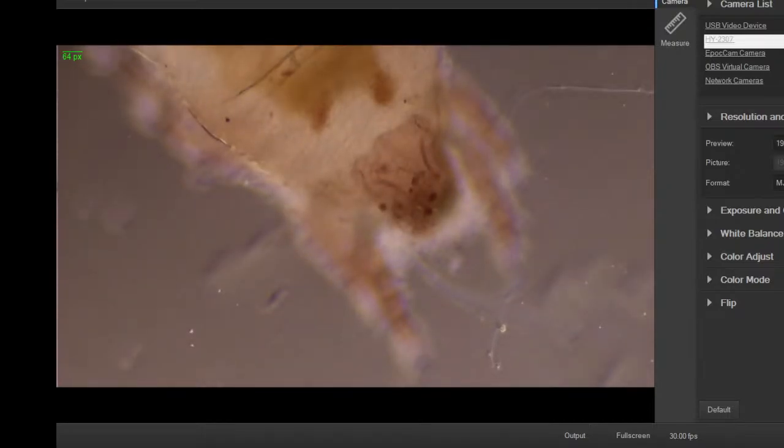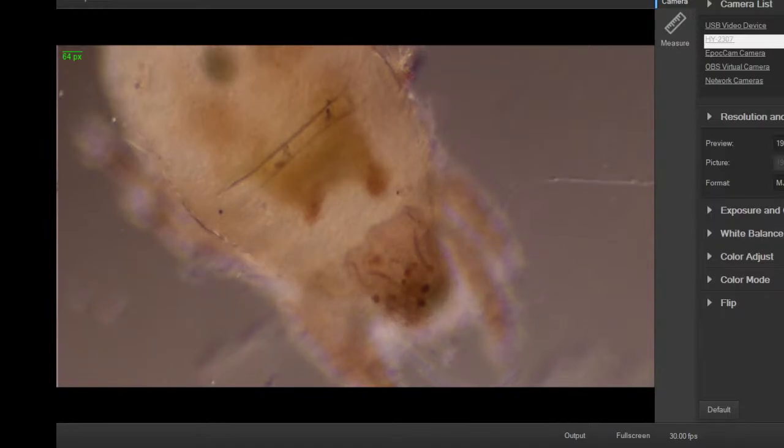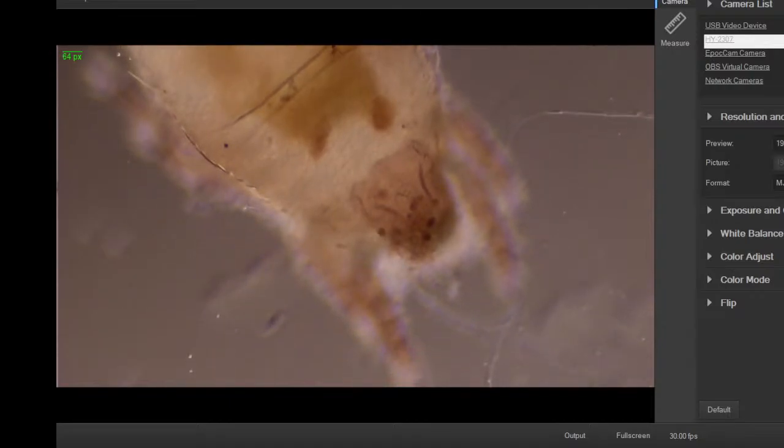But they're so small, you need a microscope to see them. Smaller than this guy. This guy's pretty good size. This is 100 power, and he's basically filling the frame of the camera for sure, but he's almost filling the actual field of view on the microscope. Cool.